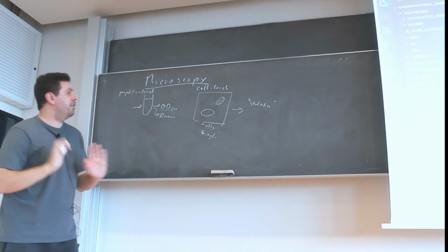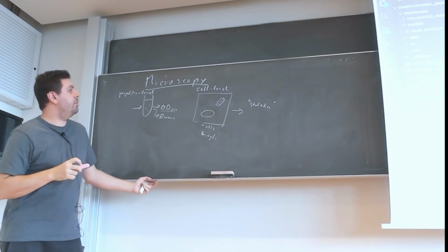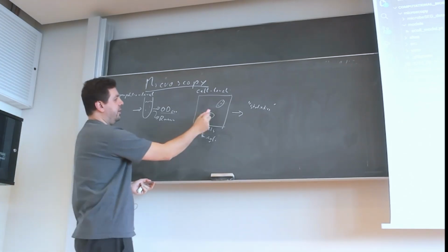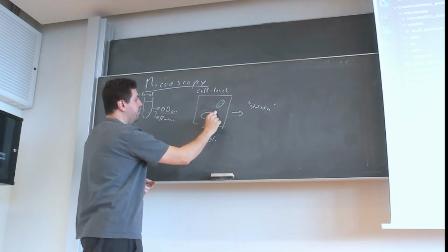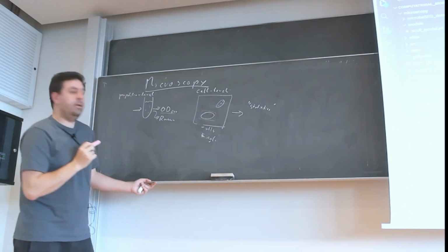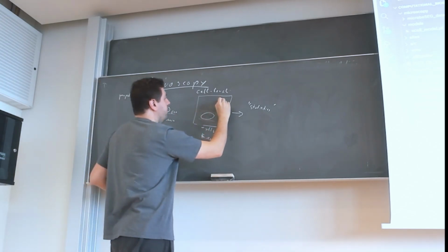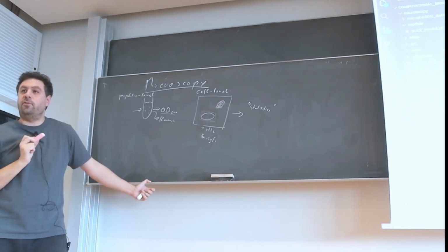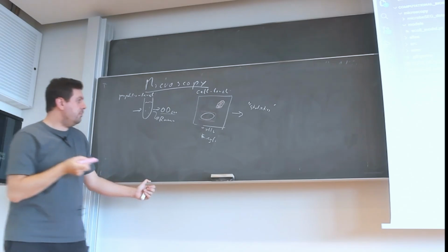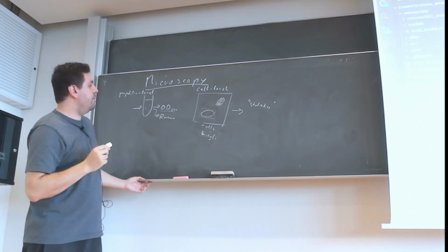This would be a label, but it doesn't tell you where things are. And the next concrete thing is segmentation. Segmentation often comes in two aspects. Either it puts a bounding box around this and tells you there is an E. coli inside here, or it's even pixel level segmentation, where it gives you this pixelated area and tells you this is an E. coli. This is a pixel that belongs to an E. coli. And so this is for single images.